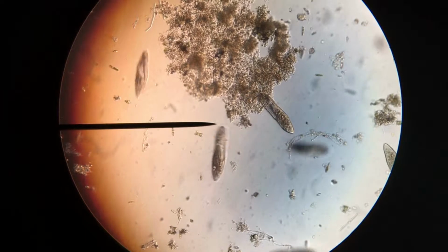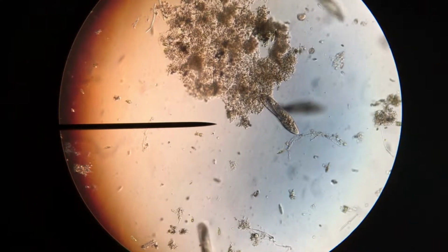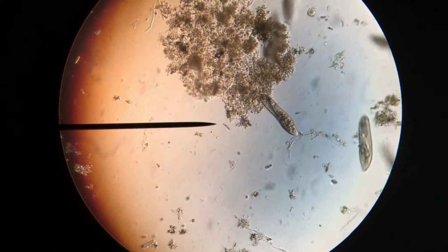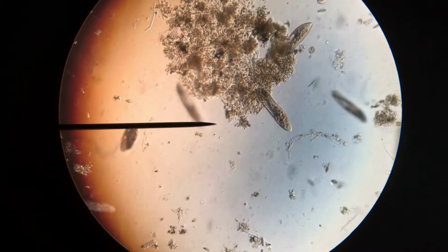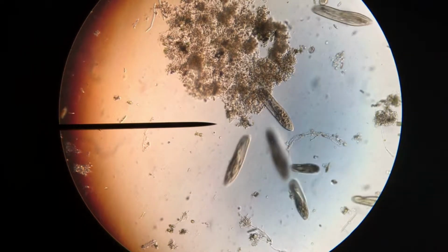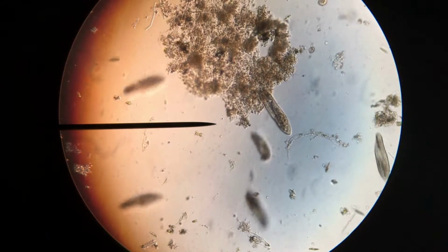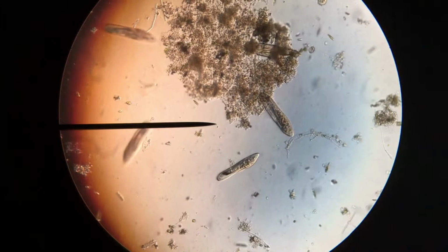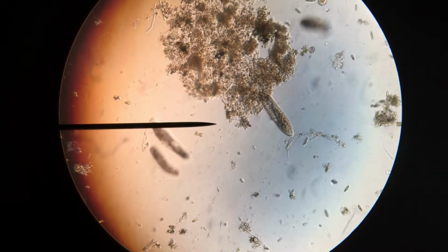Right here in this field, you should be able to spot the very big guys. Those are all paramecia. You can tell by their characteristic shape, motion, and oral groove. But you can also see some nice little green euglena cruising along, much smaller. It's true that usually at the bottom of the pond you're going to see fewer euglena because there's not as much light there and they love to photosynthesize. But you'll definitely catch some, and of course it was impossible for me not to get some water sample from the other levels when I took this one.